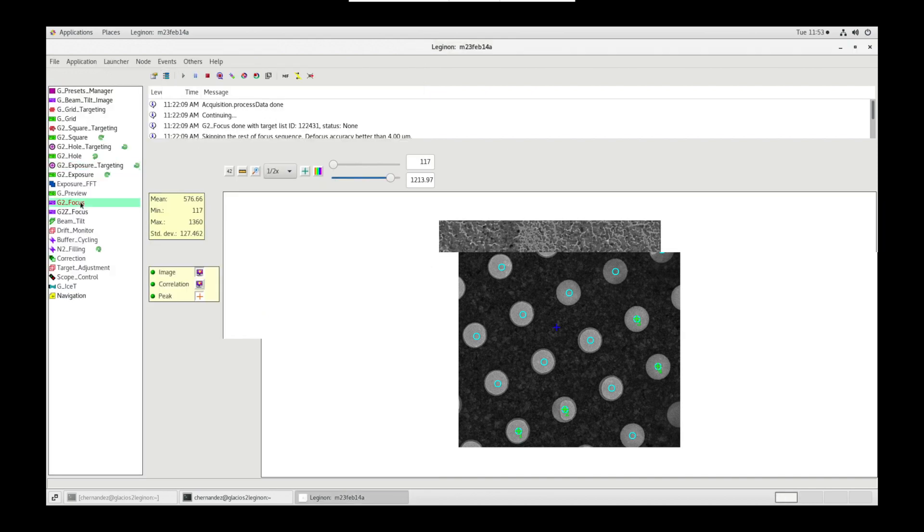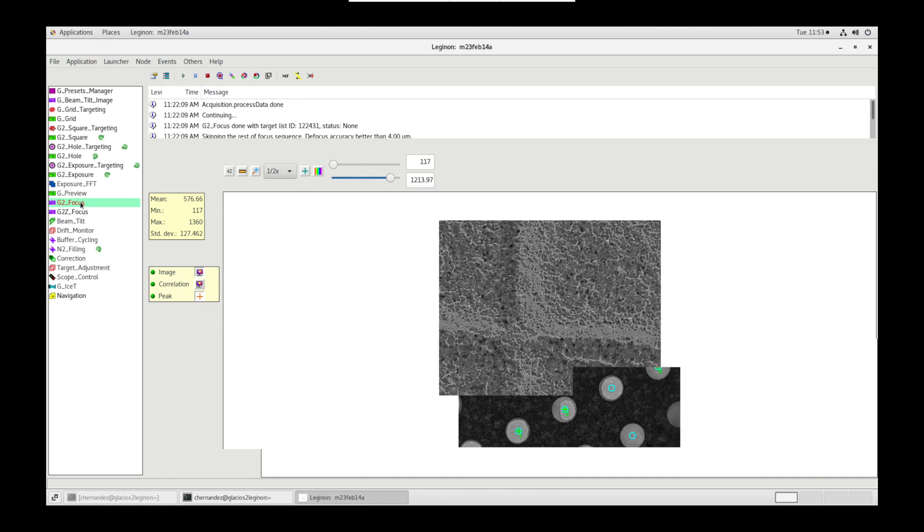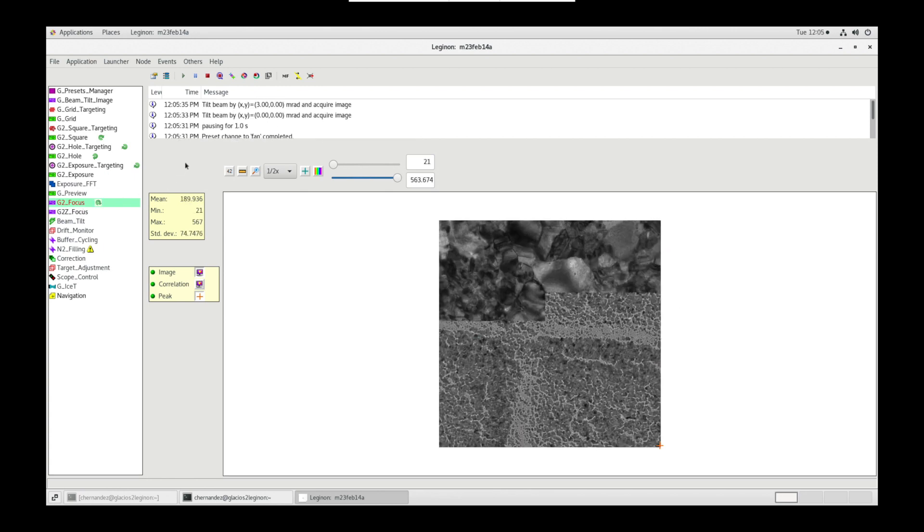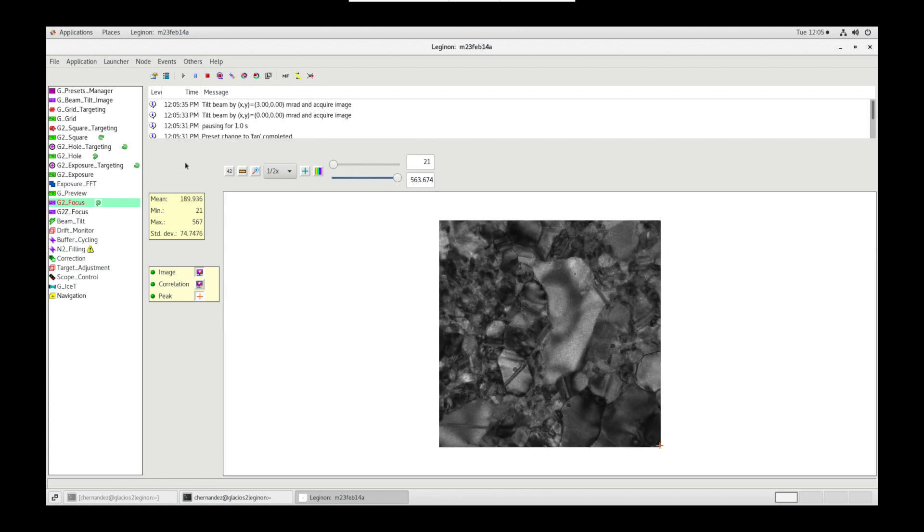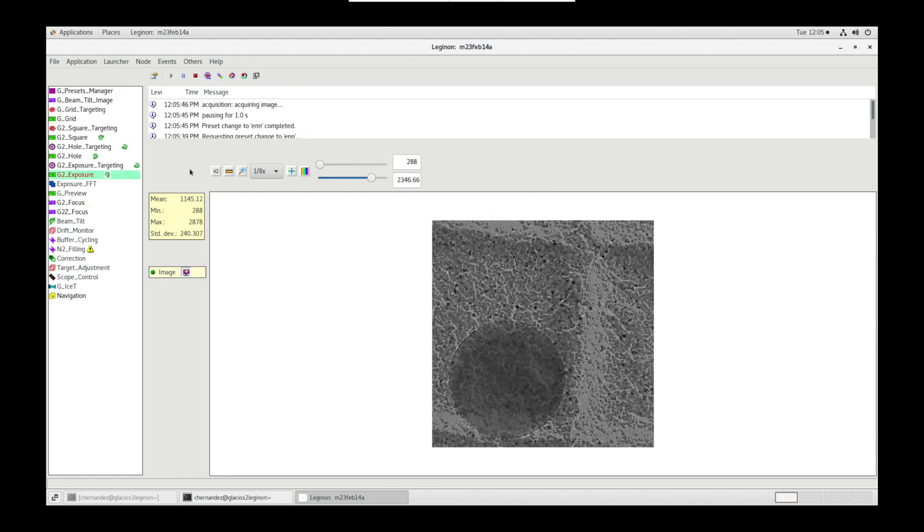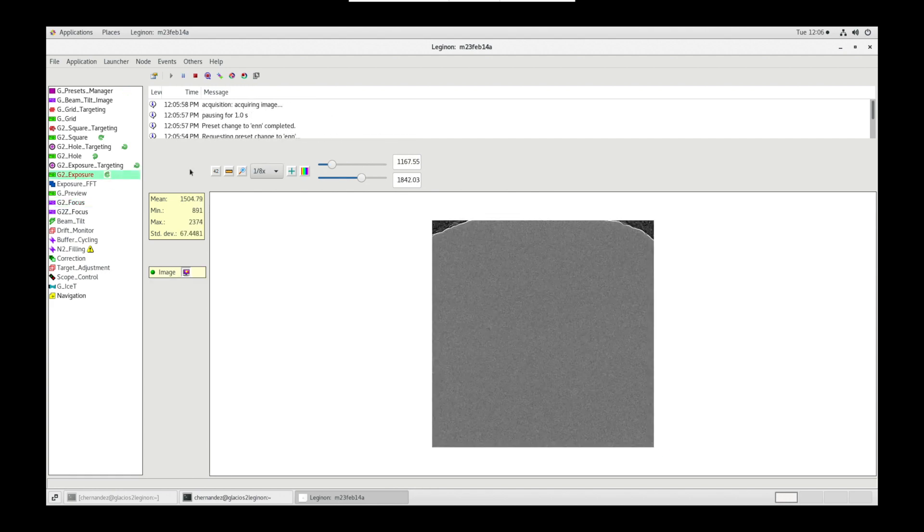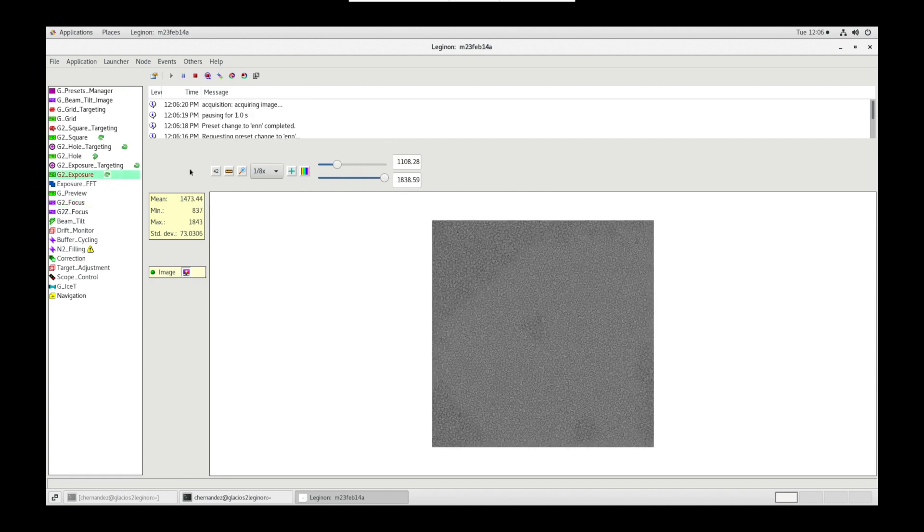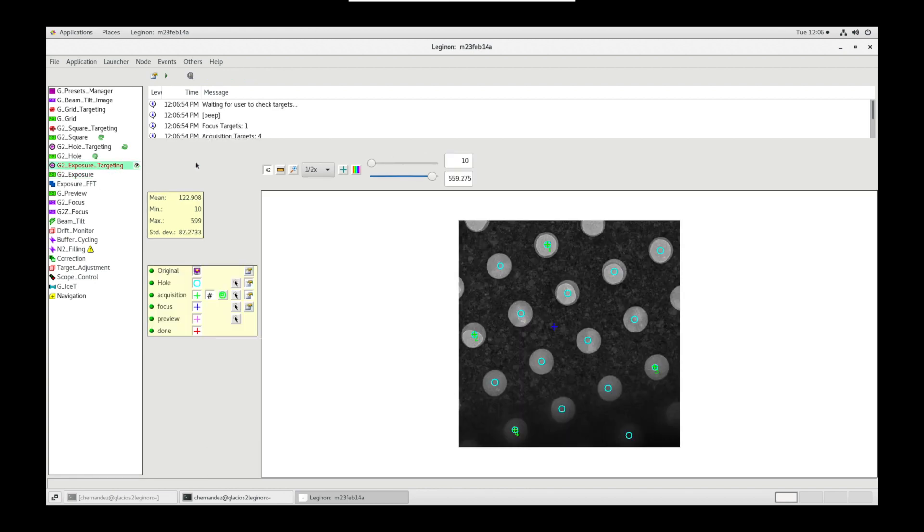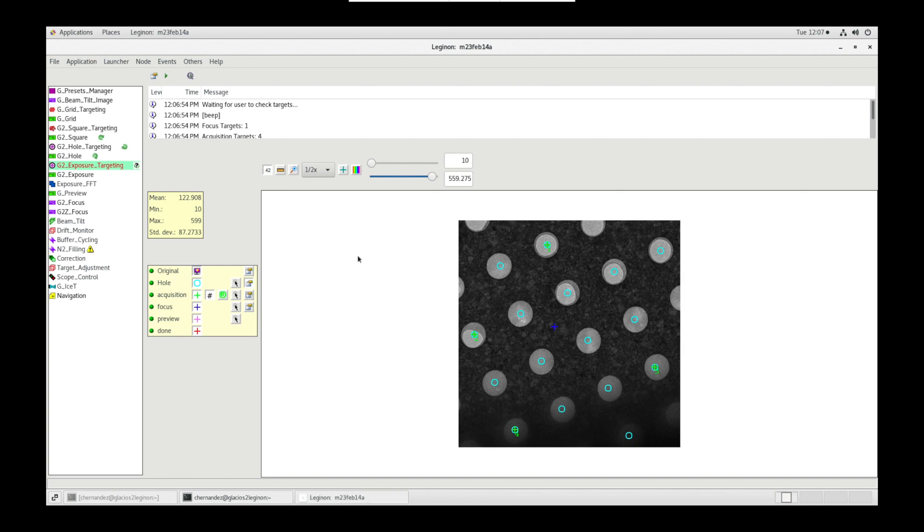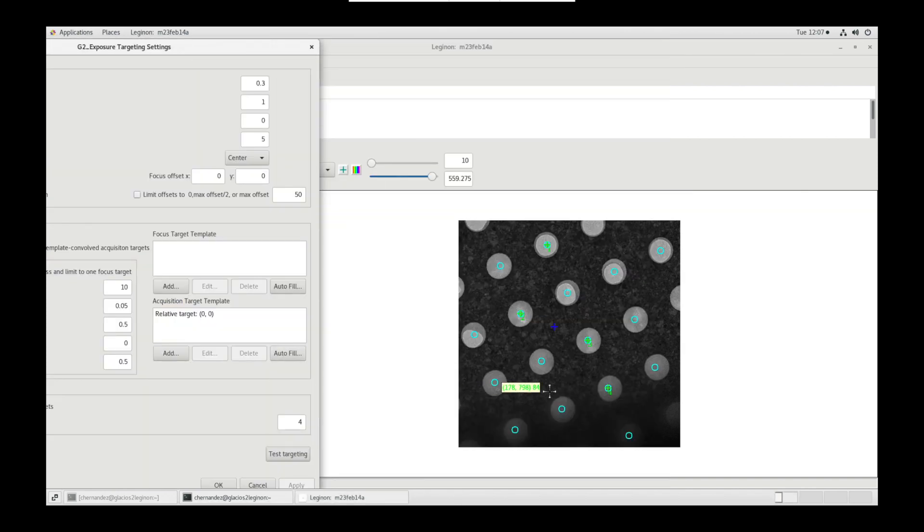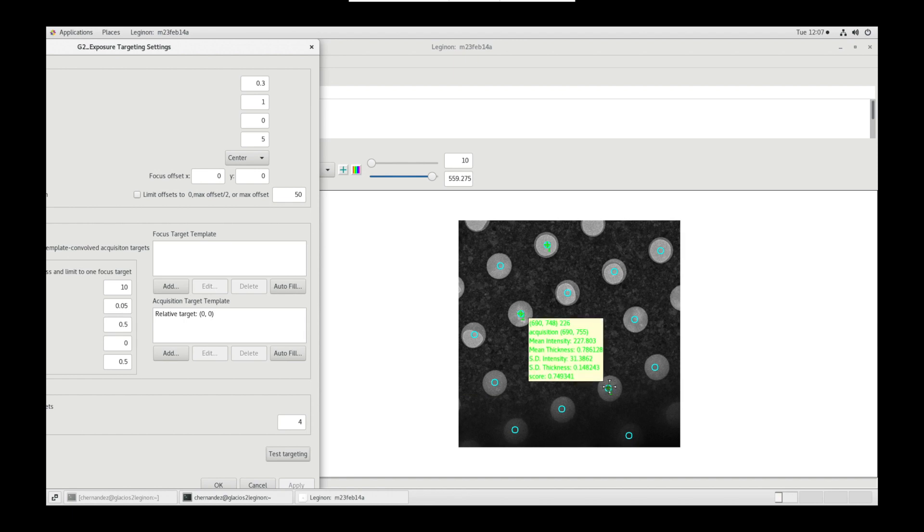Now let's head to focus node. Legendon will automatically find eucentric focus for us. We can then head over to exposure node to see our high magnification micrographs being displayed. When it's complete, head back to exposure targeting for the second HLN image. Analyze the targets picked. We can change our threshold values to make sure we're taking optimal images.